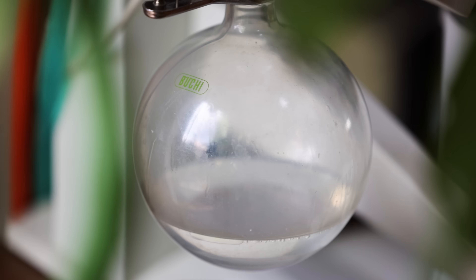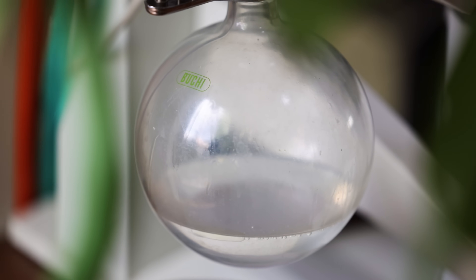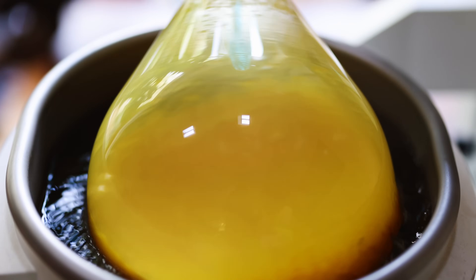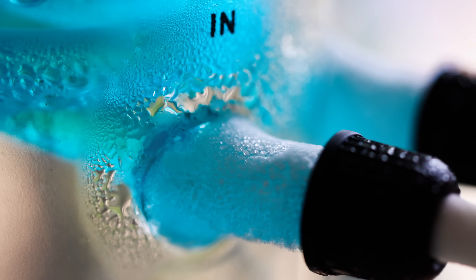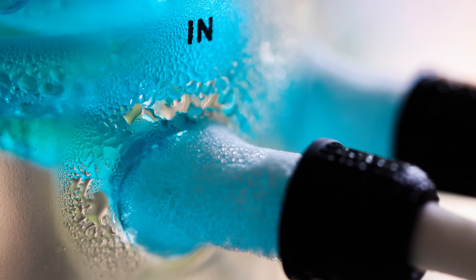The liquid that condenses on these coils then drops down into the receiving flask where it's collected. For the most efficient distillation possible, there needs to be a difference of 40 degrees Celsius between the temperature of the water bath and the condensing coils. So if I only want to heat my liquid up to 30 degrees Celsius in the main flask, those condensing coils have to be chilled right down to minus 10 degrees Celsius to give that 40 degree difference.